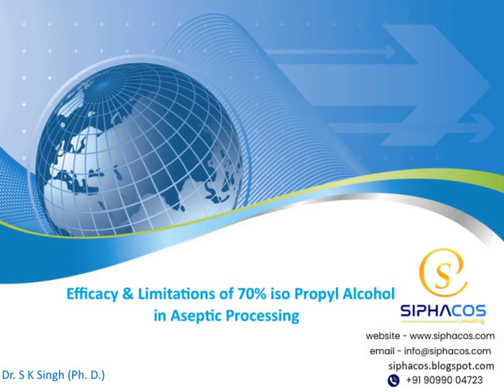Today, we will be exploring the efficacy and limitations of 70% isopropyl alcohol in aseptic processing. My name is Dr. S.K. Singh, and I hold a PhD in this field. Over the next few minutes, we'll look into how this disinfectant works, its strengths, and some of the challenges we need to be aware of. So let's get started and dive into the topic.